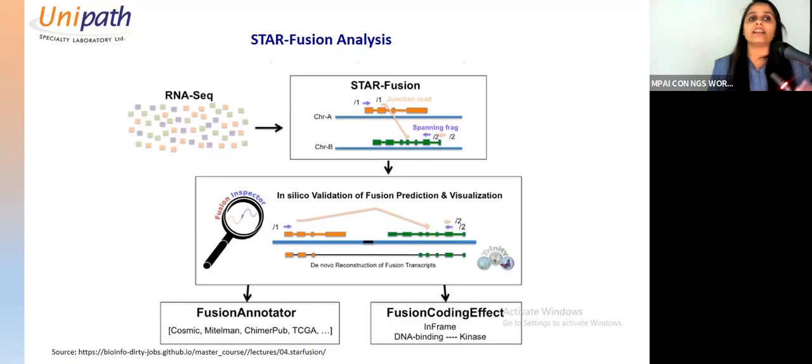So usually both reads should go to the same gene, right? In the ideal case. But if your reads show this trend, R1 mapping to this portion and R2 mapping to the other, that gives you evidence that fusion has occurred. So that's why, with the help of split reads and spanning reads, we identify the fusion. So this is what has happened, right? This has merged with this.